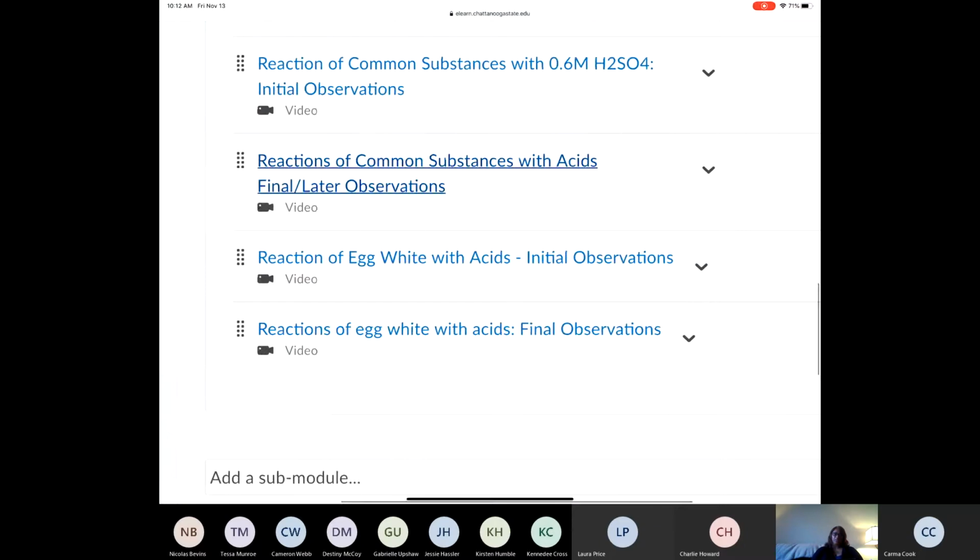And the last two videos just involve the egg white. Your initial observations of the egg white reacting with the 3 different acids, and then of course your final observations. When I first videoed the lab, I had forgotten to bring egg white from home. So I had to wait until the next day to do the egg white reactions.